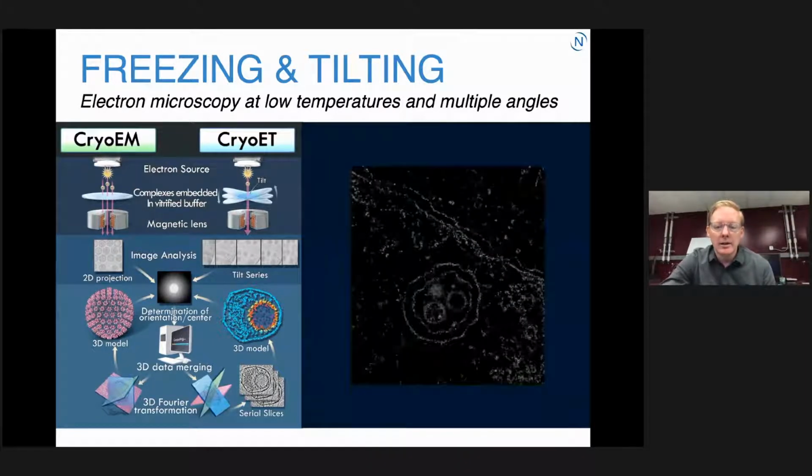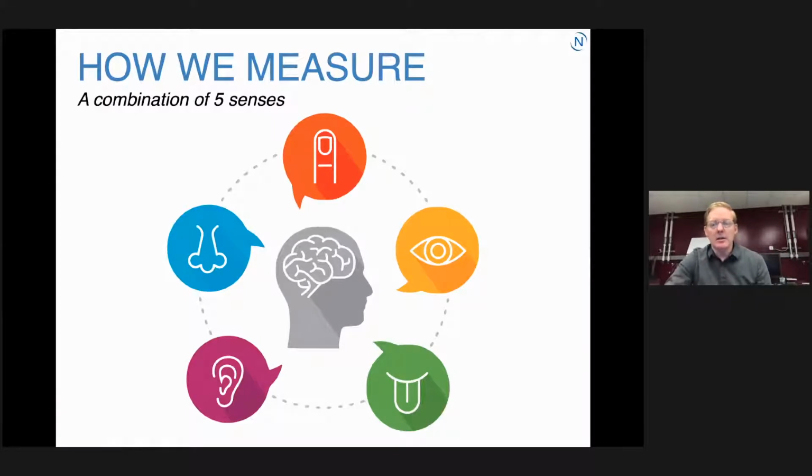And so the last one that we'll hit on is, I mentioned we're talking about these analogies of sight and touch. Those two, if you think about them, are really advanced technological versions of our sense of sight. They operate in a very similar way, right? You're firing a laser, photons at a sample, and you're looking at how it interacts with that sample at a distance. You are firing a coherent electron beam at a distance and understanding how those electrons interact with the sample. But the sample is over there. The detector is over here, right? I'm looking at something from far away.